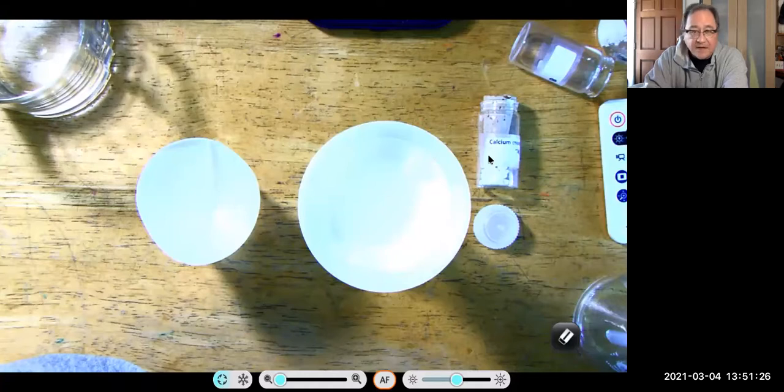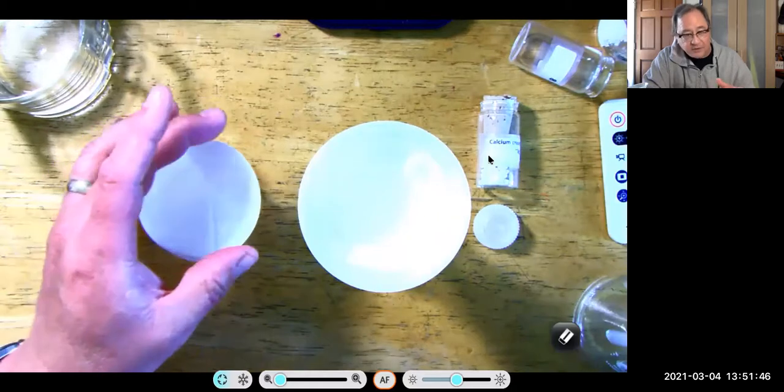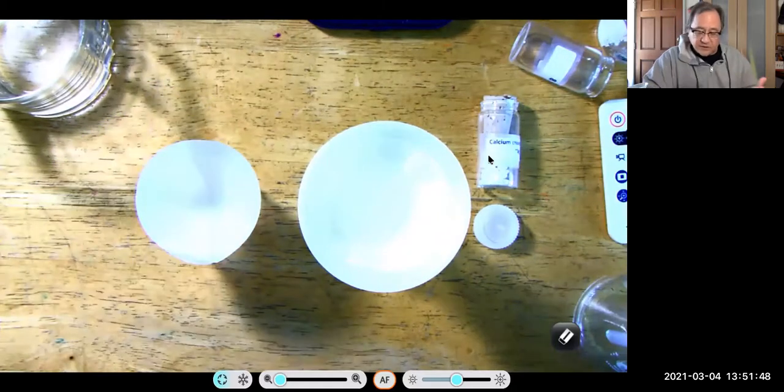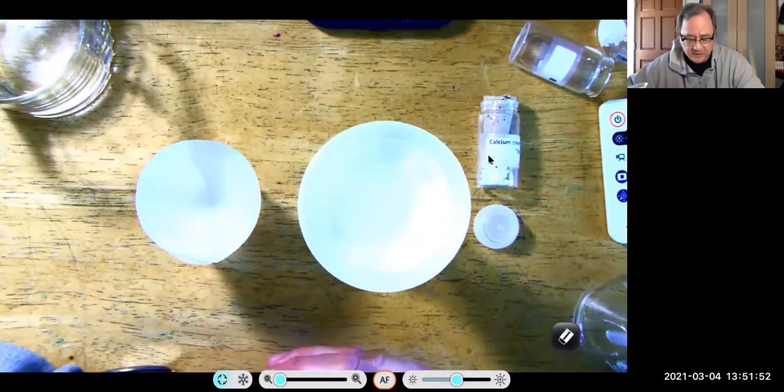So just remember that if you're going to use as an excuse that you got your homework wet, you stuck it in the oven to dry, the teacher's going to ask you, what temperature did you have the oven? And if you say 200 degrees, they're going to say, nice try. Paper doesn't ignite at 200 degrees Fahrenheit. All right. So you want to put this in your oven at 200 degrees. Why 200? Well, because a cooler temp is going to be safer.